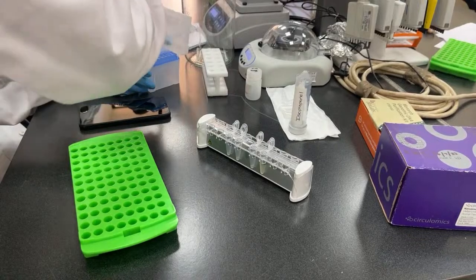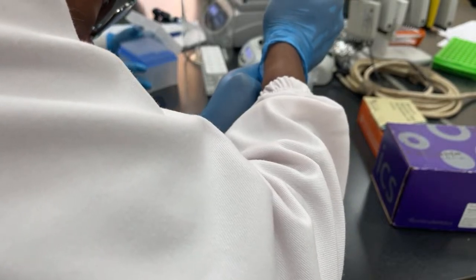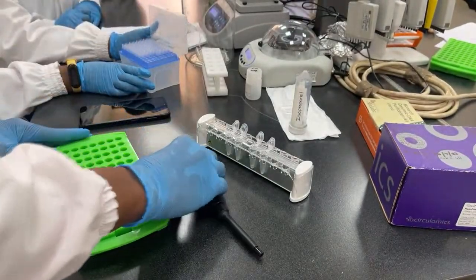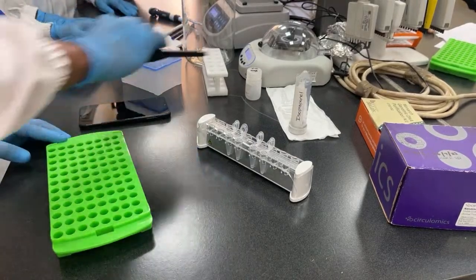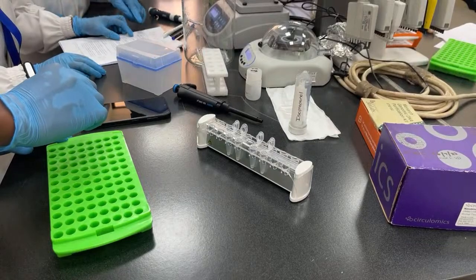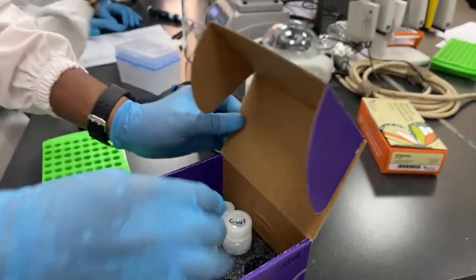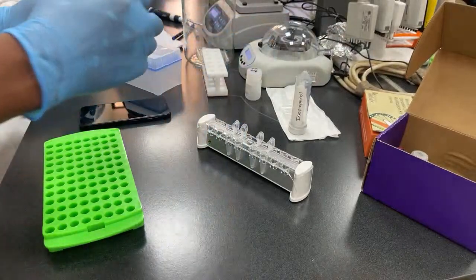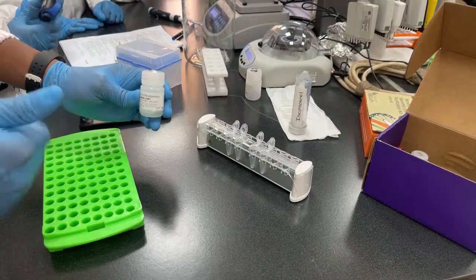Fingers crossed that we're not throwing away the sample. What do you use for washes? Buffer CW1. Okay, so let me wash. 500 microliters of wash buffer. This is the one, CW1, wash buffer 1.